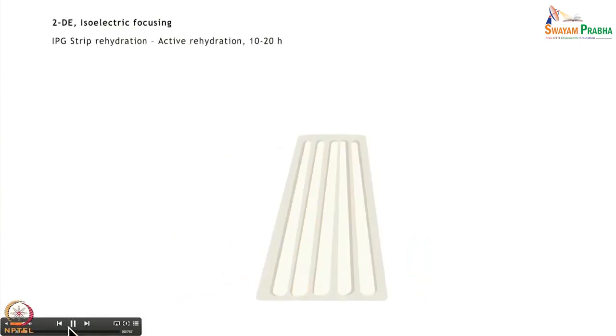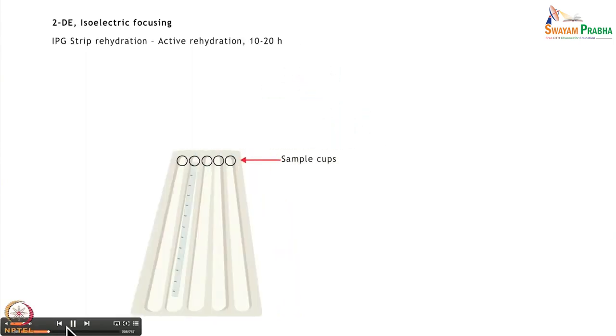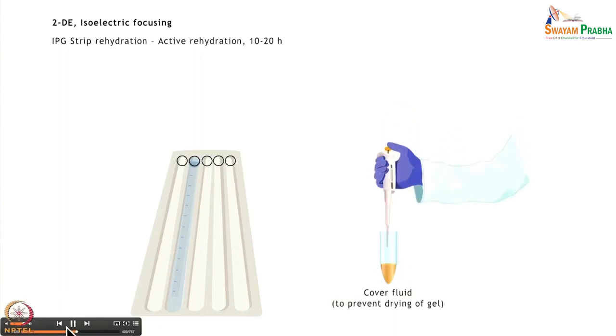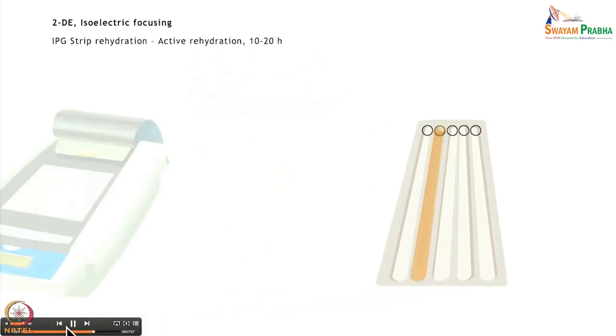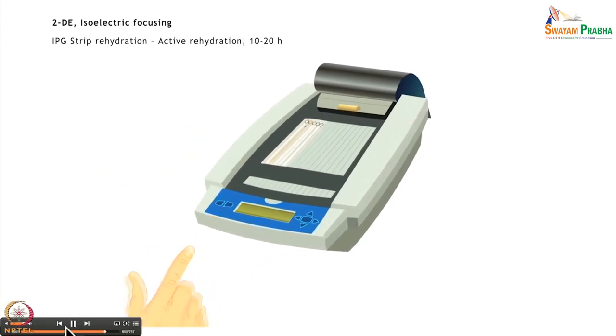In active rehydration, the protein sample is added to the strip via a sample cup, followed by cover fluid to prevent the gel from drying up. This is then placed in the isoelectric focusing instrument and low voltage is applied, which allows the strip to take up the protein sample. Active rehydration is also performed for 10 to 20 hours depending upon the length of the IPG strip being used.